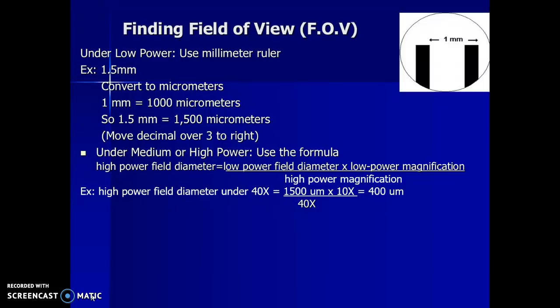That means your field of view has decreased, but your image has enlarged. It's almost like you focused in. So you have focused in, your image got bigger, and your diameter got smaller. So remember, magnification increases, field of view decreases. They are inversely proportional.